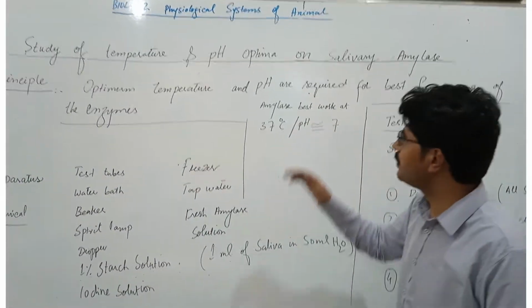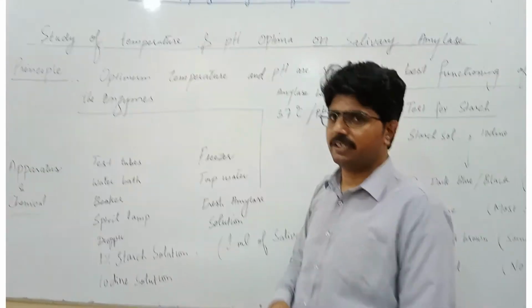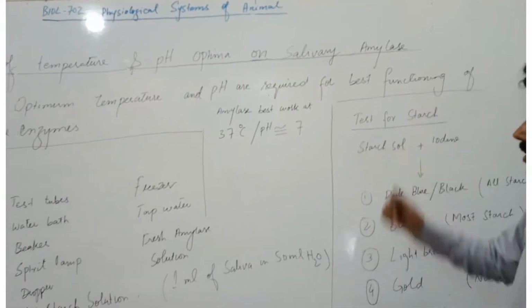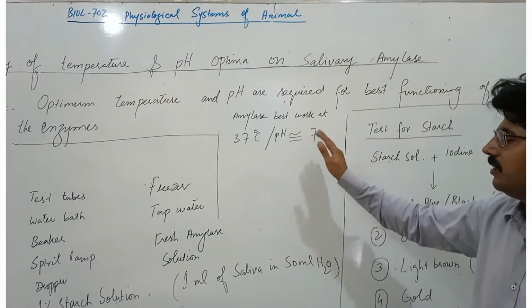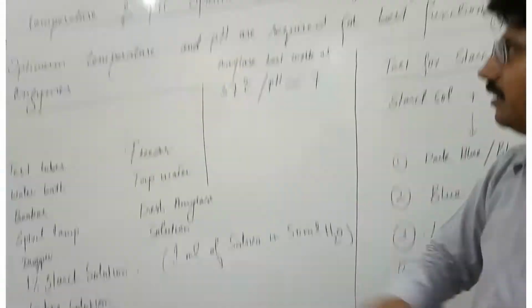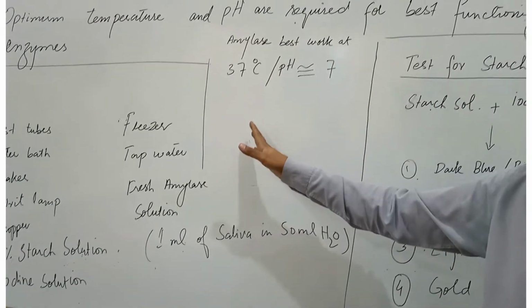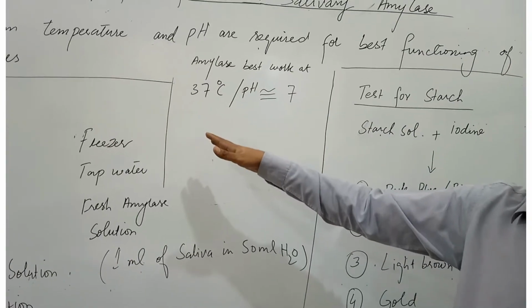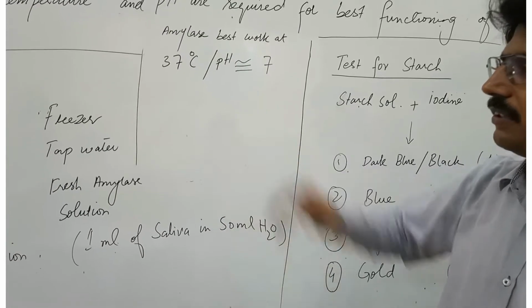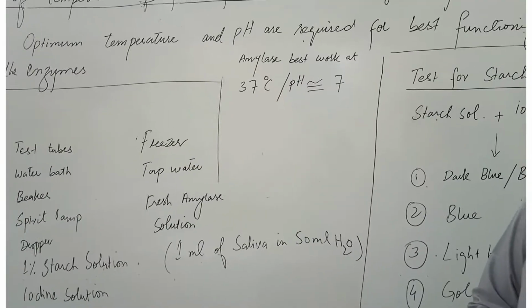Study of temperature and pH optimum on salivary amylase. The principle of this practical is that optimum temperature and pH are required for the best functioning of the enzyme. The amylase that we are going to use is salivary amylase, and it works best at 37 degrees centigrade and pH 7. If we increase temperature beyond 37 or decrease below 37, or increase pH beyond 7 or decrease below 7, the functioning of this salivary amylase would be affected.